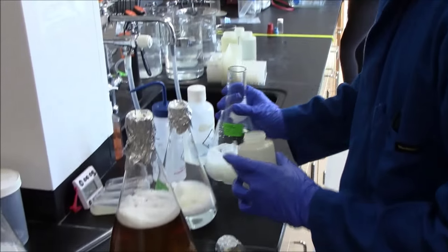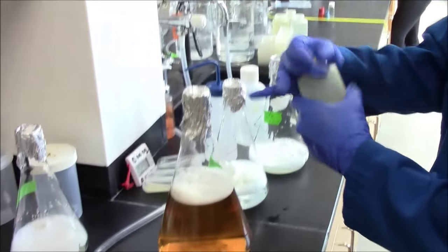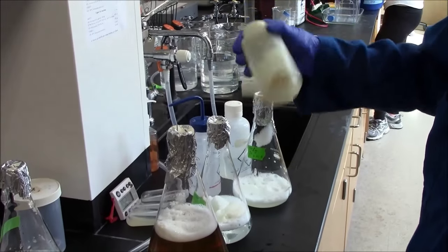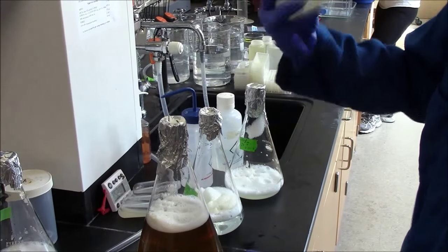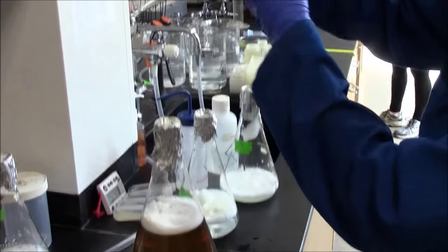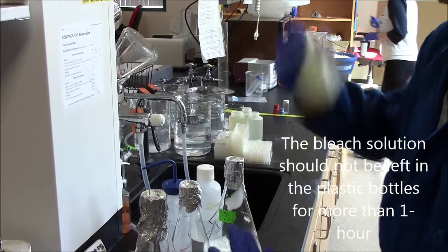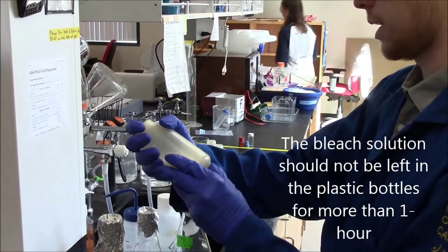While the supernatants are on ice, you can use this time to disinfect the centrifuge bottles that have the bacterial cells. Here Josh has poured some of the 10% bleach into the centrifuge bottle. He's swooshing it around to suspend the cells so they'll be killed by the bleach. And once again, at least 30 minutes, maybe an hour, is good to kill the cells.